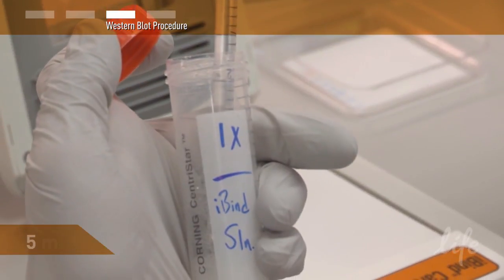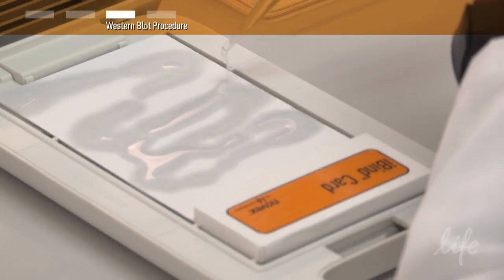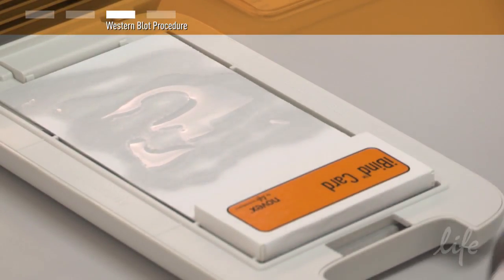Pipet 5 milliliters of the 1X iBind solution evenly across the flow region of the card. Be sure not to wet the stack.